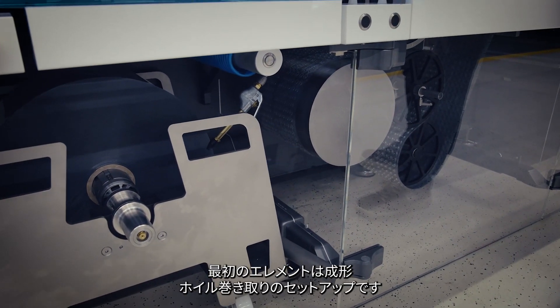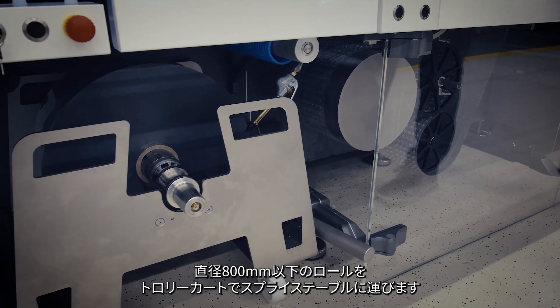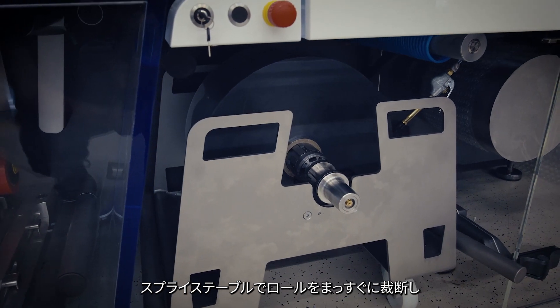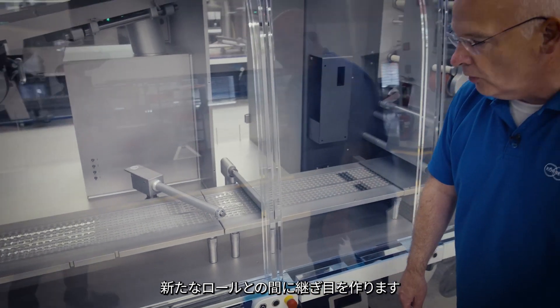The first element is the forming foil unwinding setup. On the trolley cart you can present rolls up to 800 millimeter diameter, which are then presented to a splice table where you can cut and prepare a splice between roll end and new roll.